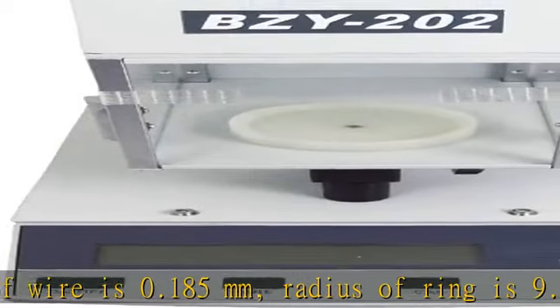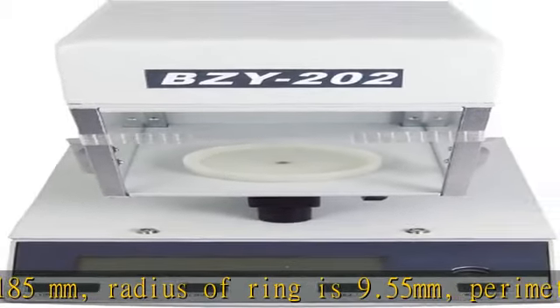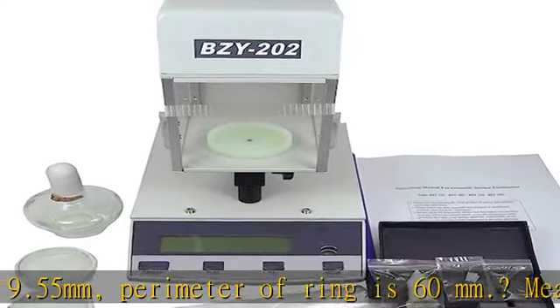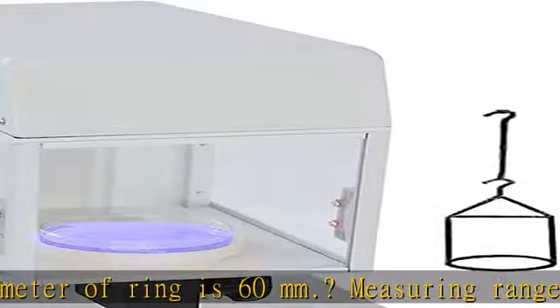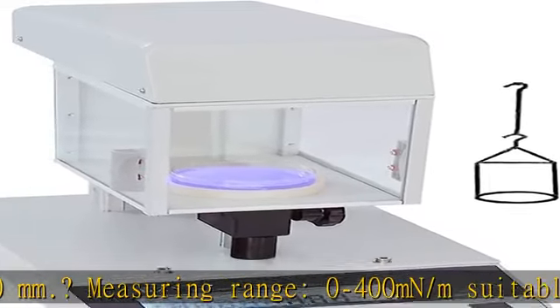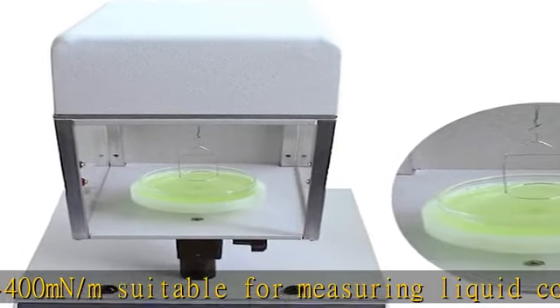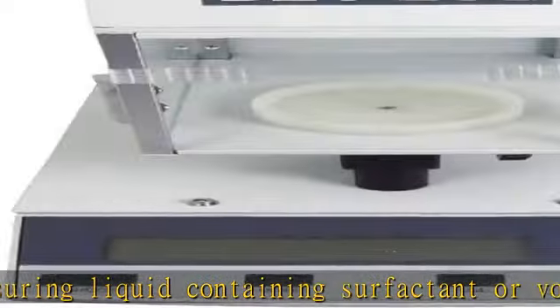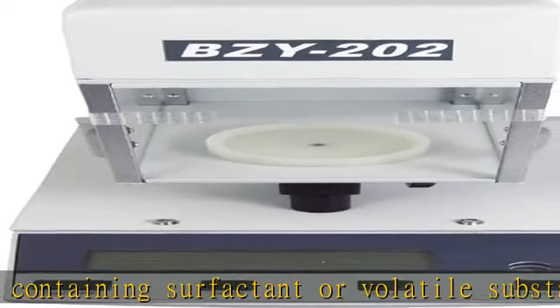Suitable for samples whose surface tension will change with time. Data accuracy and reliability: the deviation of the instrument is very low because of its own structure, which ensures that all errors in measuring can be controlled effectively. Simple operating: one-key resetting and one-key calibrating can be realized rapidly and exactly, without being controlled by any external computer.